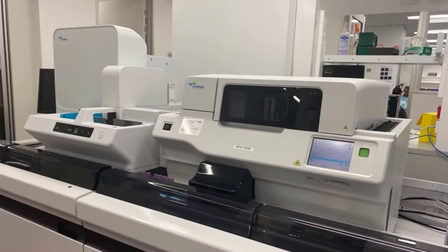While it's important to know how to make a slide manually, you should also understand that some laboratories have an automated slide maker.